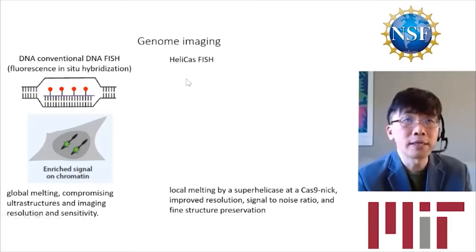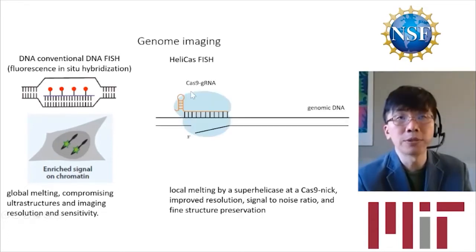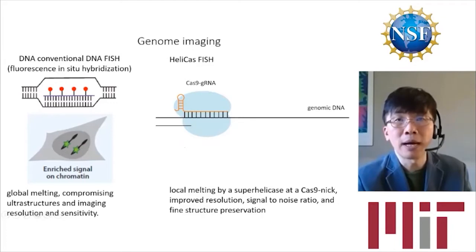So in helicase FISH, for helicase Cas9 FISH, we melt the DNA locally, shown here. So we use a Cas9 to create a nick. This is a nickase version of Cas9. And then the 3' overhang gets recognized by a helicase, a super helicase that we engineered called RepX. It'll get loaded here. It'll move down the 3' to 5' strand to unwind the downstream duplex genomic DNA, exposing the top strand for annealing by labeled DNA probes.